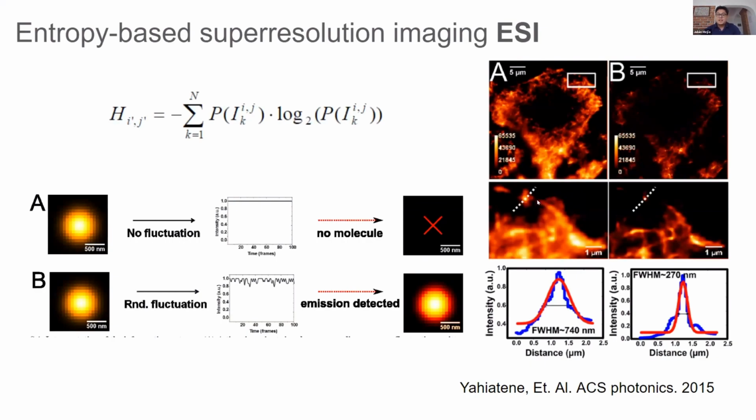For instance, take this image, which is the ground truth image that they acquired, and they managed to fit this Gaussian to this Gaussian emission. After doing the ESI analysis, you can reduce the full width half maximum of this Gaussian significantly. I would say at least 2 sigma is the reduction, which is something really, really good. Also, pay attention to this part.